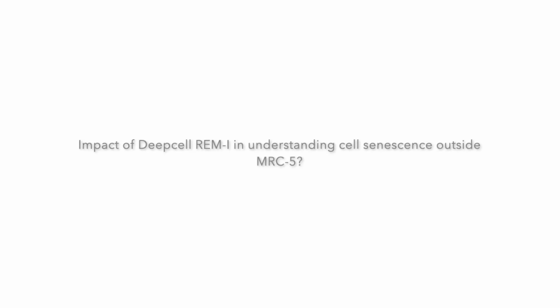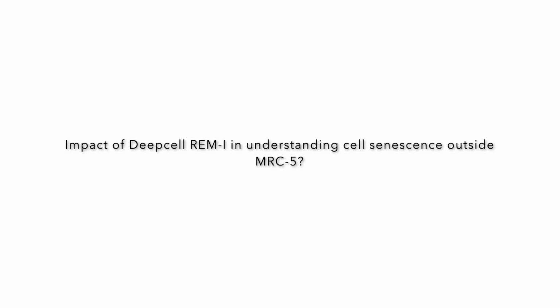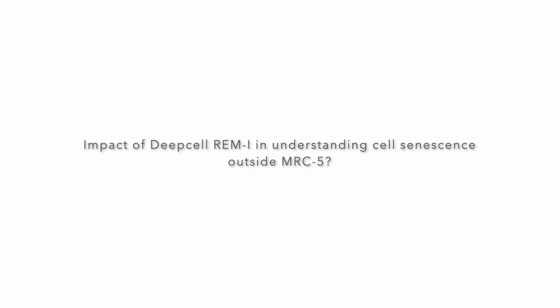So what we were not able to show you because of timing is that we were actually able to use DeepCell in identifying morphological features in, for example, diabetic and non-diabetic patient samples, as well as red blood cell PNH samples. So what we're hoping to do with DeepCell in the future is start building these subsets and candidate images to demonstrate what a senescent cell looks like in these specific samples, and hopefully use that as a candidate reference image for image analysis.